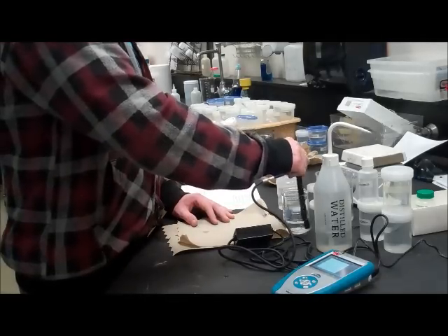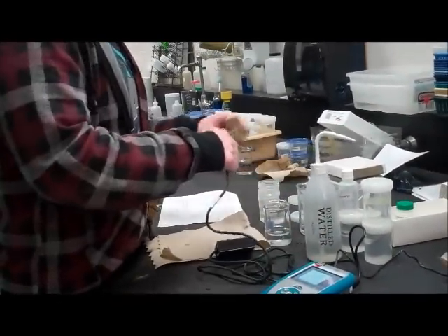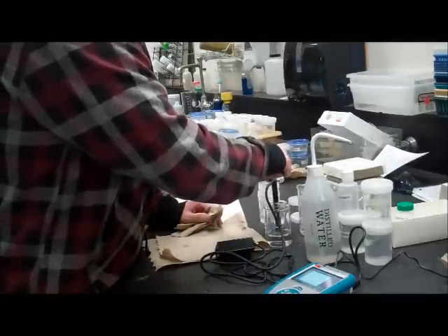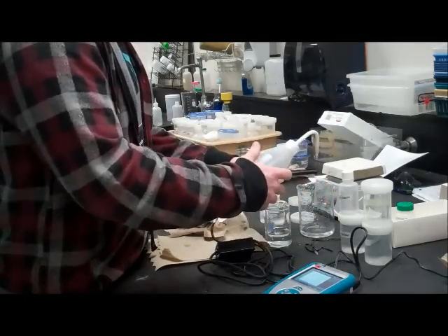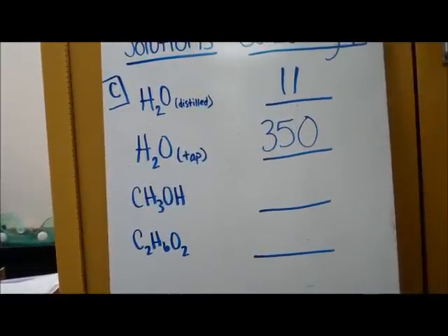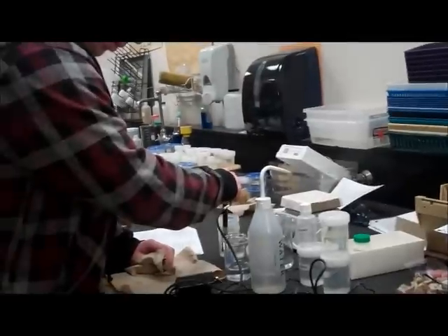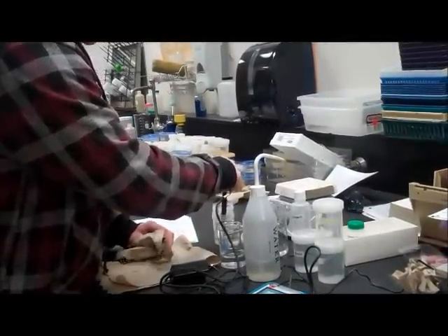We are now testing group C solutions. 11. 350. 100.